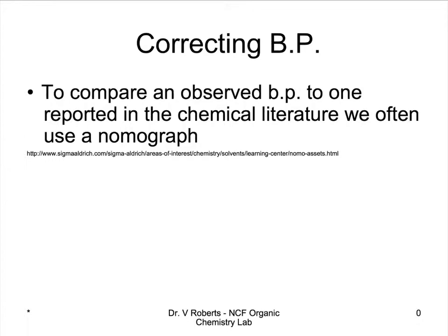So if we check our barometric pressure and we're not at 1 atmosphere, we would have to go to this website to get a nomograph, where there's a correction.